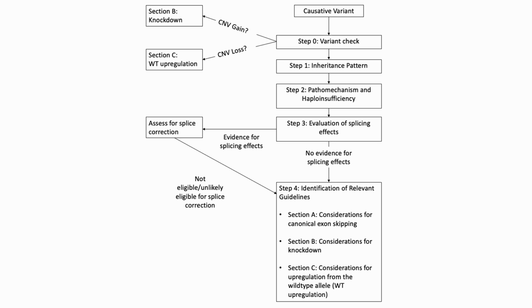In this video, we will be assessing a GLDC nonsense variant for eligibility towards ASOs. As always, we must first check if this variant is correct. Greater detail on how this can be done can be seen in the ABCA4 video example. This variant description is correct.